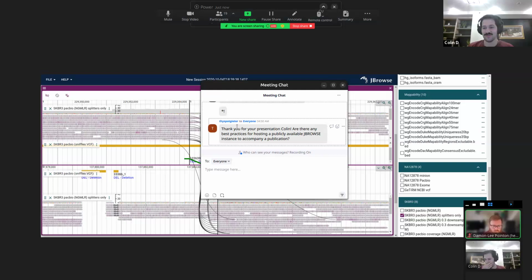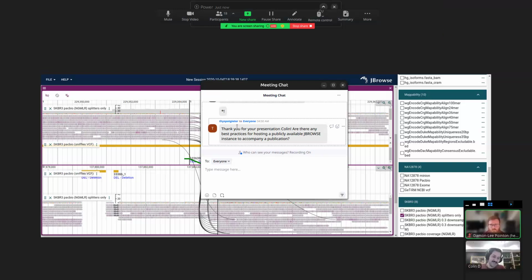If you want to play around with fun modern technologies, there's Amazon S3, which doesn't even require hosting a server that is just sleeping all the time. S3 is just static file hosting, and JBrowse can be entirely hosted from there, which is quite cheap. So you don't even pay $5 a month. You can pay like pennies a month. That's fine. Thanks, Colin.